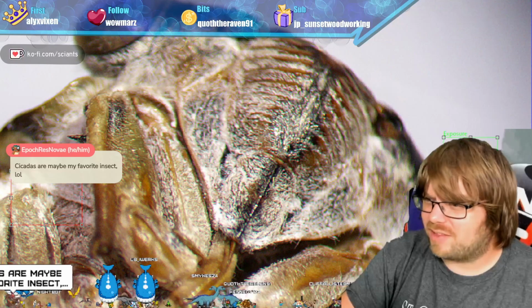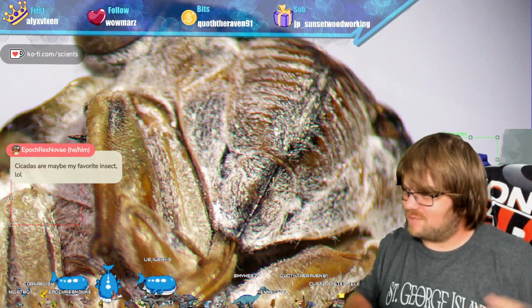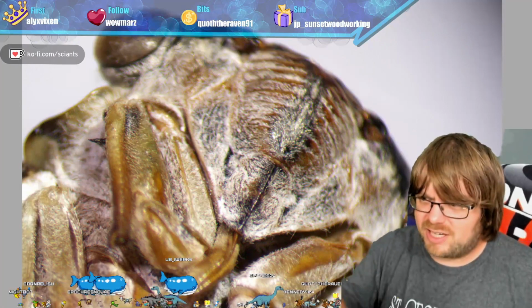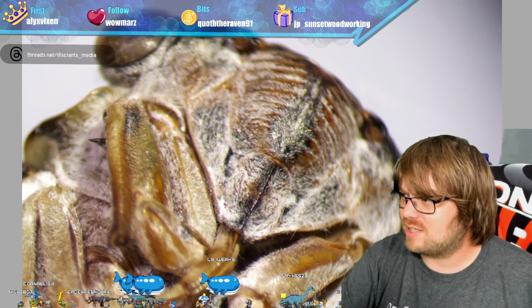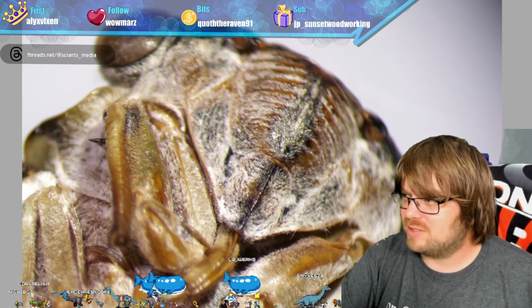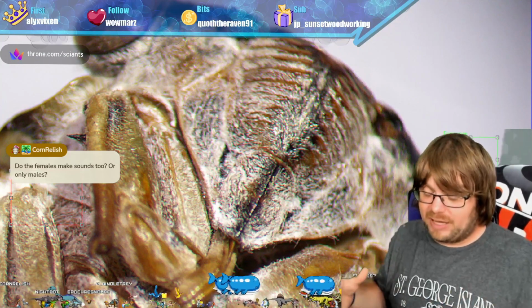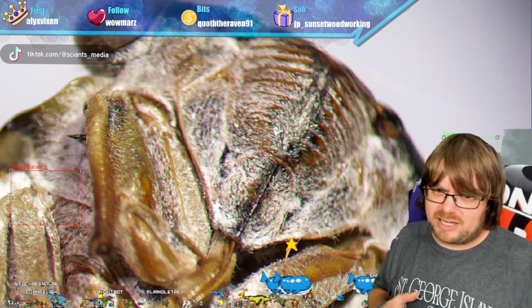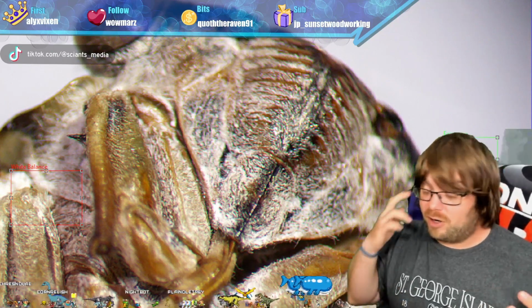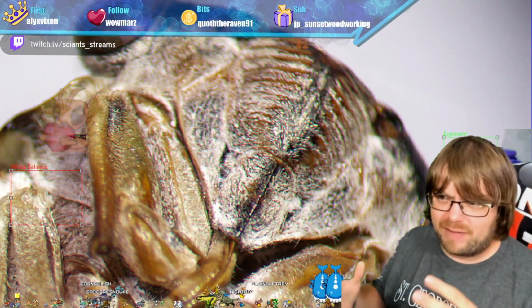I was explaining the concept of the tergites in the context of this being a female because that's where the most important changes can occur. There can be an increase in abdominal size that connects to the ovary size. So the ovaries respond to nutrition. They don't have a set number of eggs. Instead, they're dependent on food intake. So if they have a low amount of food, their ovaries shrink. And if they have a high amount of food, the ovaries grow. And they need to be able to expand that within the abdomen. That's why they have those tergites.